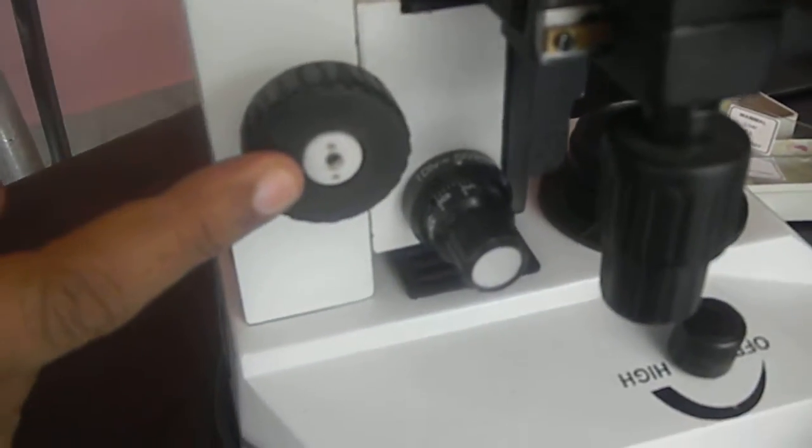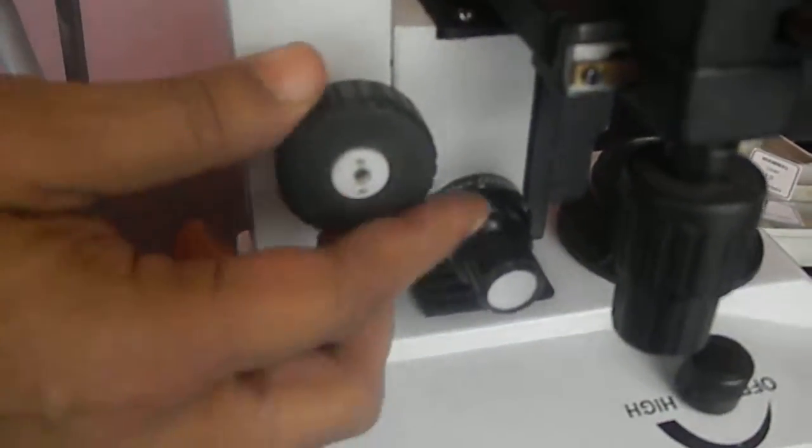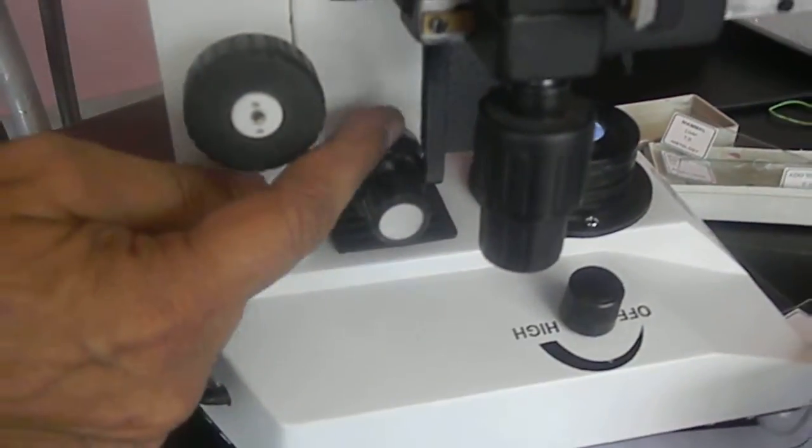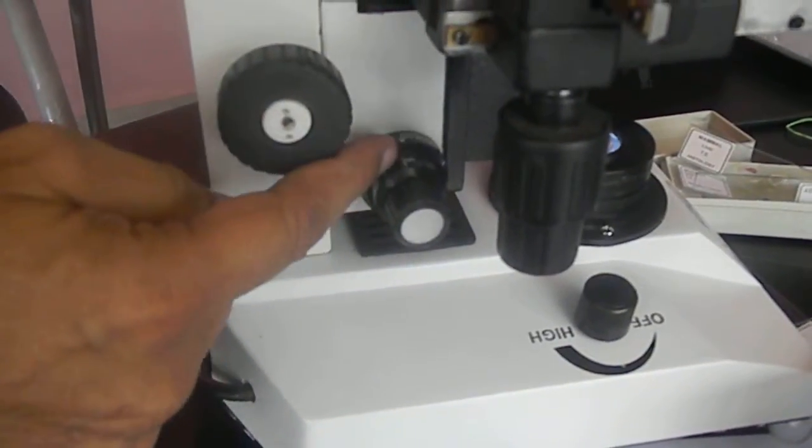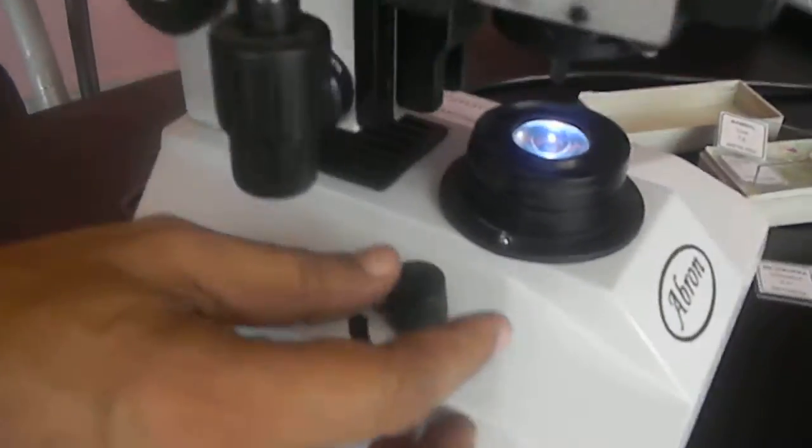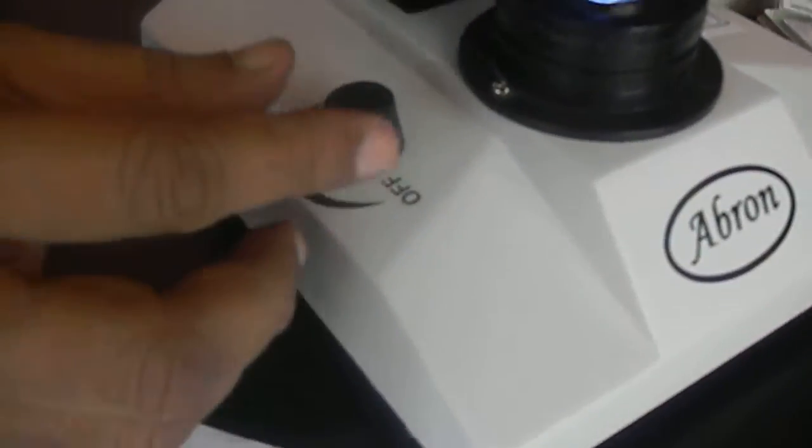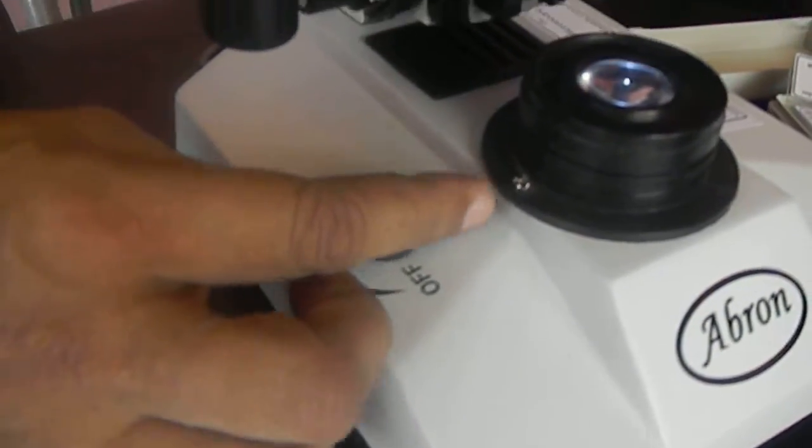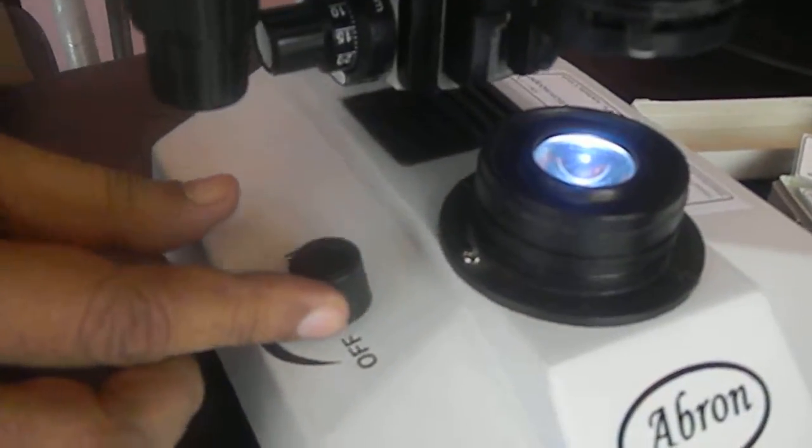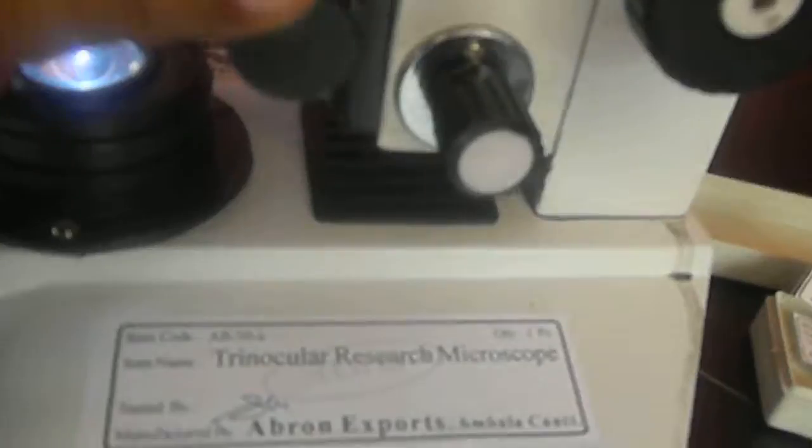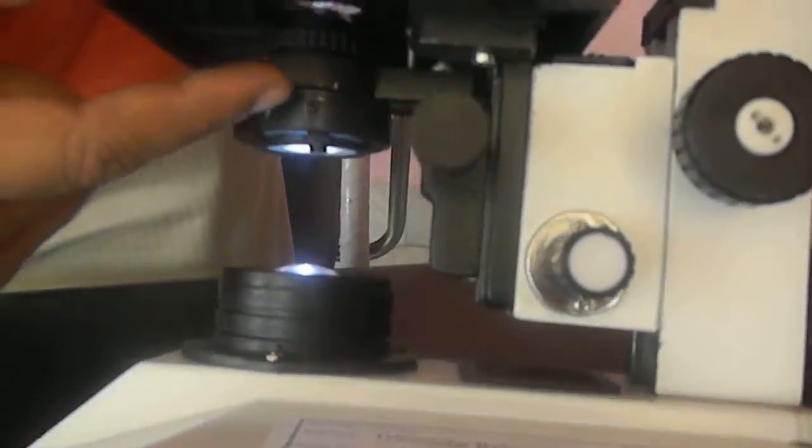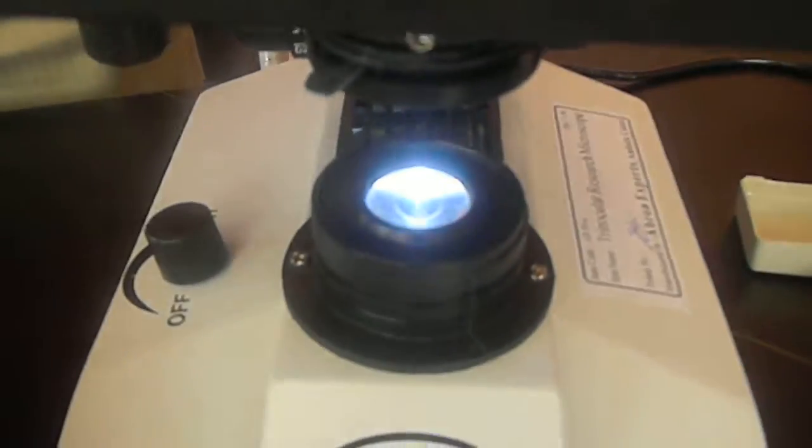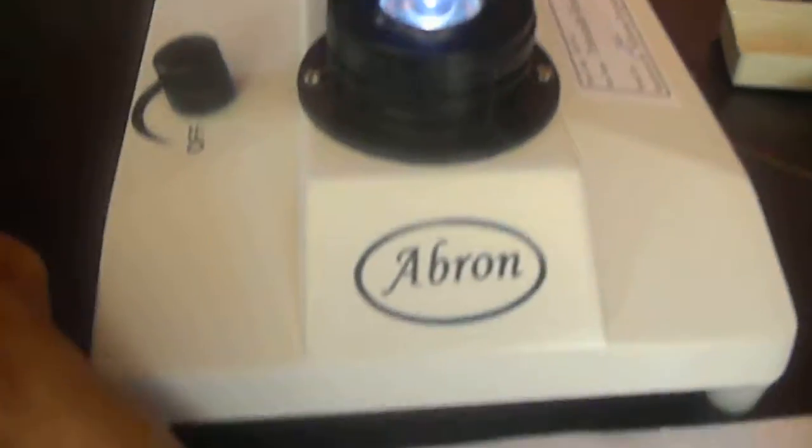Focusing, this is coarse focusing and this is fine focusing. It has a graduation. The light is having an LED light which you can change intensity. Then there is a part which is for changing the condenser. You move it and then the condenser changes. Irish diaphragm is also provided.